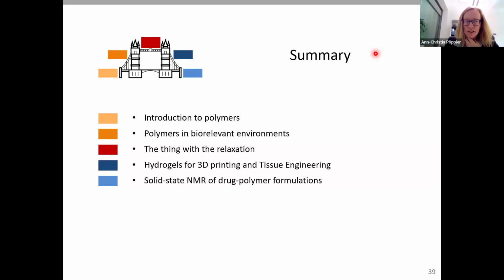So what we can do is that we can calculate the sizes of the micelles and can compare them with what we observe from cryoTEM, for example. So if we make a size distribution over all the cryoTEM images that we have and compare it to the average size that we calculate for the micelles, they are in the same dimension. So we can transfer it, and we can also, for example, follow a trend in increasing size or decreasing size.